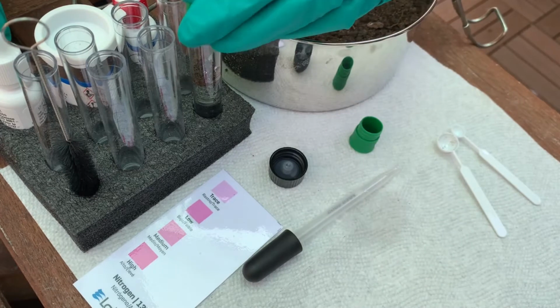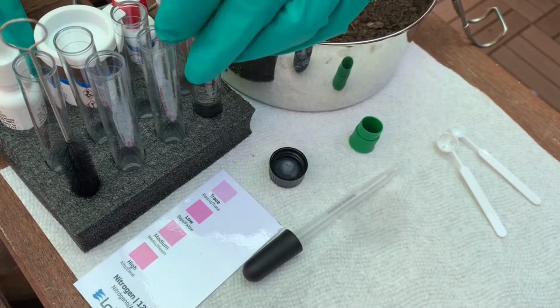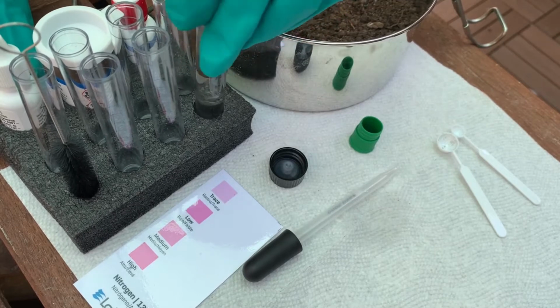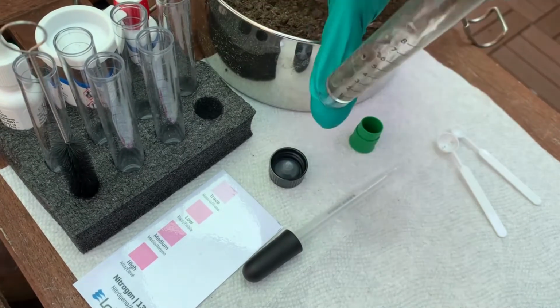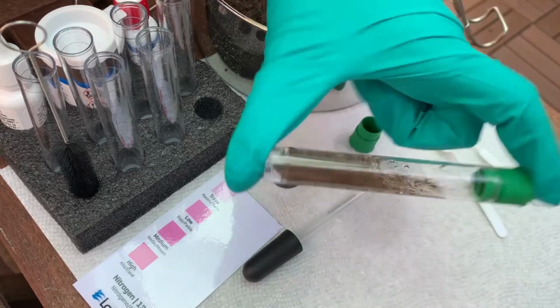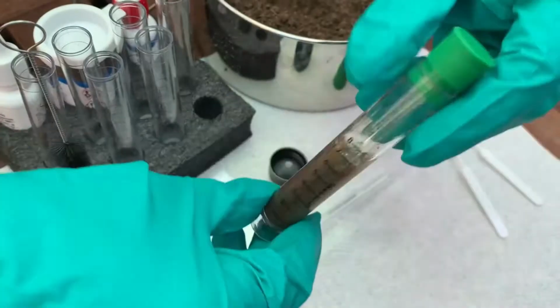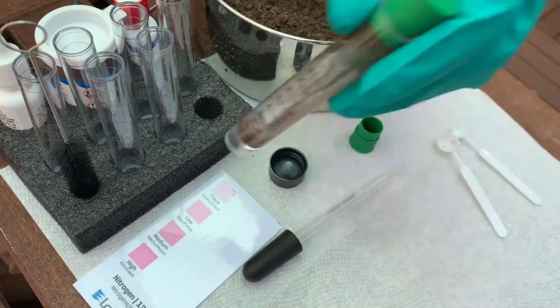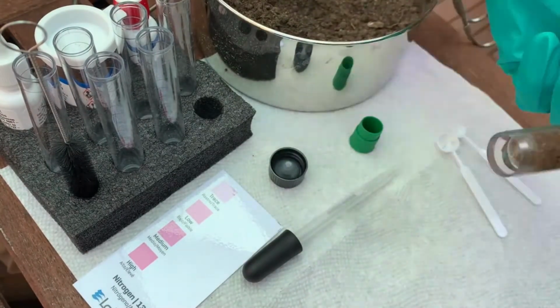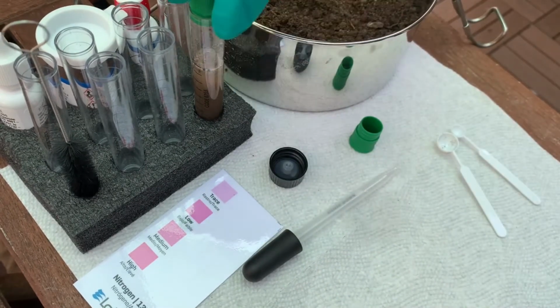And then we put the cap on the test tube. Notice I keep it in the holder just to help make sure that I don't drop or spill anything. And then you want to mix the tube gently for 1 minute. You'll see me fast forward some of my mixing just so I don't waste anybody's time, but try to stick to the 1 minute when it asks you.